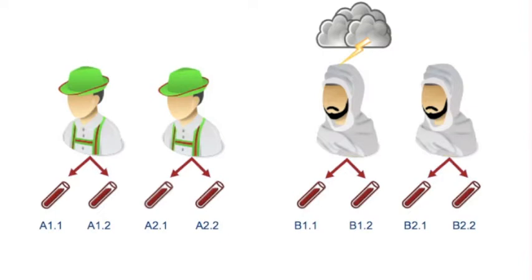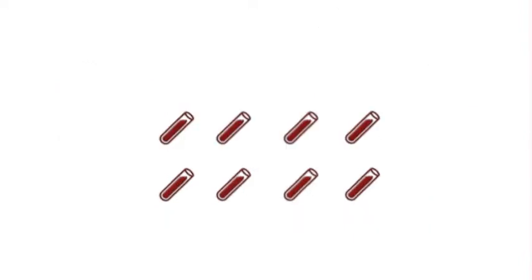We took those samples and we provided them in a blinded manner. So I had the blood, I knew they were replicates, but I didn't know which twin, which individual, or which replicate that particular sample was. And we did antibody sequencing blind.